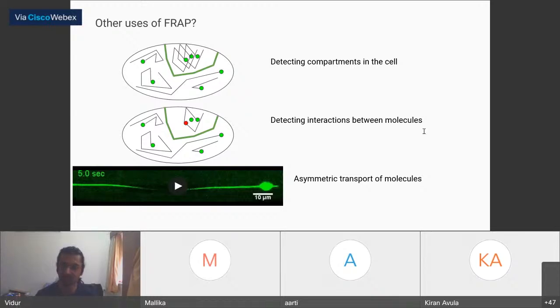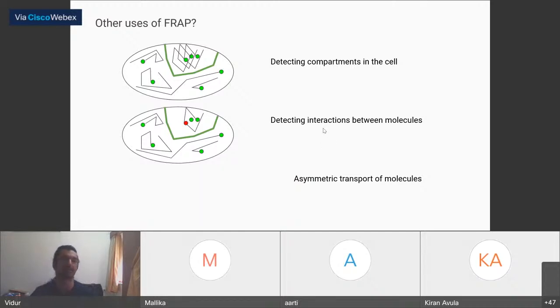And if anyone has any further questions, I don't see any more. Oh, okay. There's another question by Tejil. What is optimal transfection efficiency required to achieve 80% bleaching?